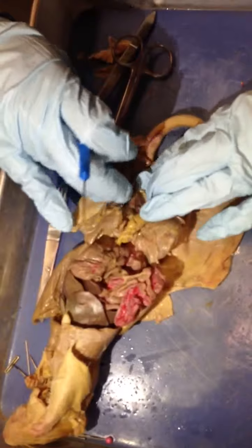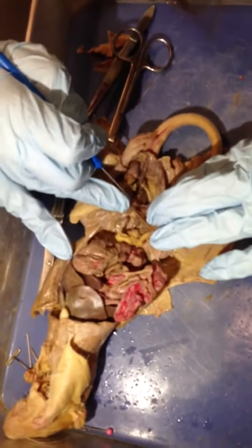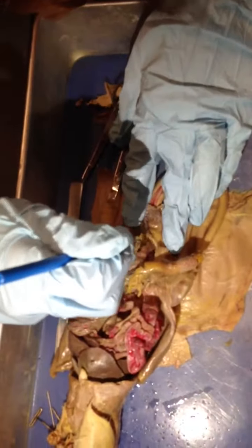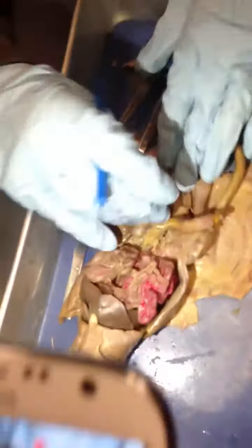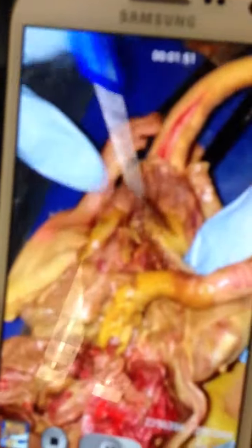So the muscles down here, the one that's kind of above the penis, right here, that's your ischiocavernosus muscle. Sorry, I'm trying to get out of your guys' way. But then the one right below it is the bulbocavernosus muscle, and then the one down below, like on the body of the wall, is the bulb of the penis. And then you have to look under here, and this little gland right here, that's the bulbourethral gland.